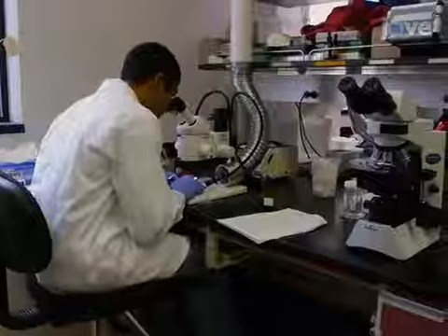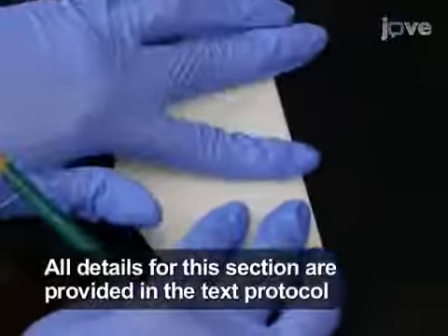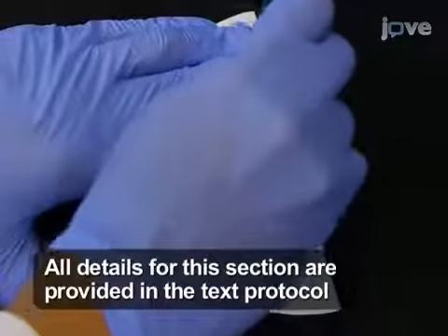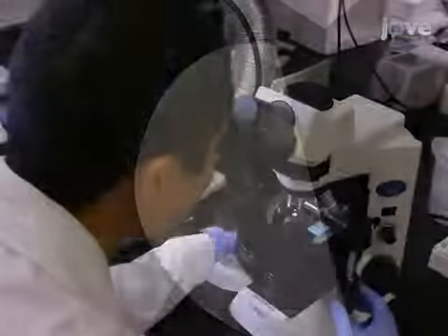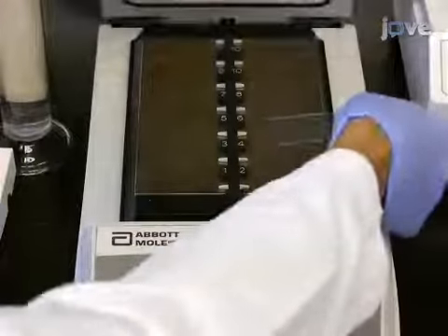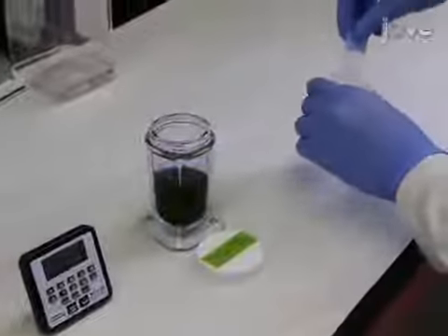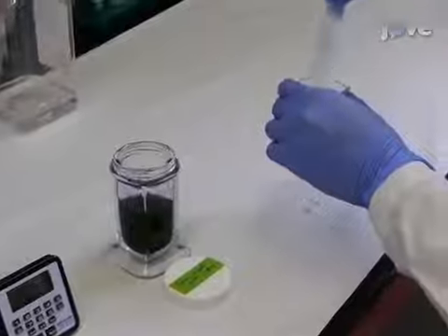First, isolate the polytene chromosomes, in this case from the ovaries of about 5 mosquitoes, fixed in fresh Carnoy's solution. Once a good chromosome spread is confirmed, the chromosomes are flattened by denaturation, followed by cold, overnight incubation. The next day, the chromosomes are dehydrated and washed to prepare them for microdissection.